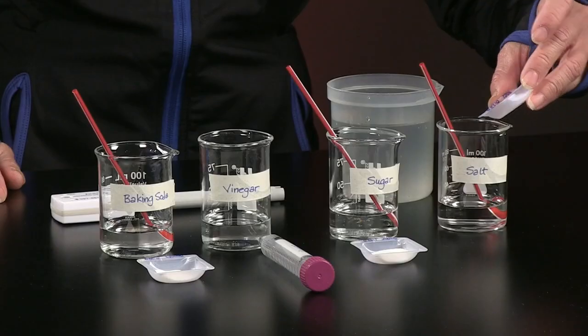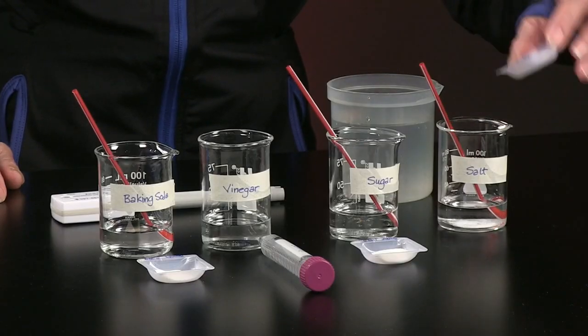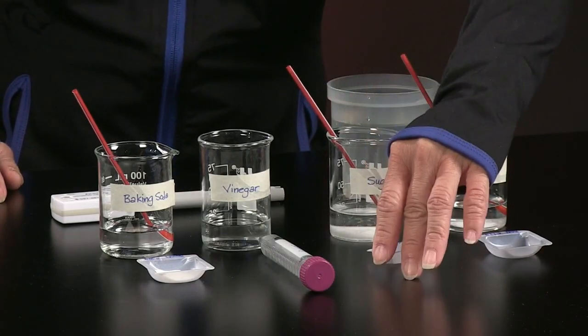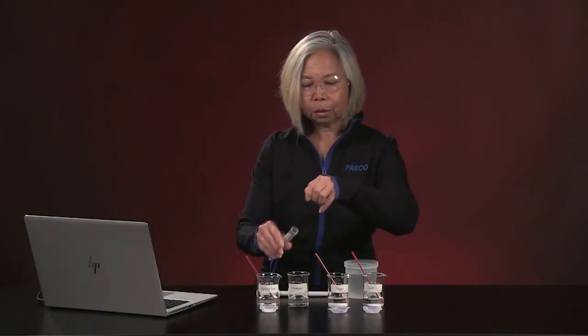So to begin this experiment, we are going to take each of our white substances and we're going to be adding it to the water that's in the corresponding beaker. So that's our 0.23 grams of sodium chloride being added to its own beaker, 1.43 grams of sugar. Here's our vinegar, 5 milliliters pre-measured.